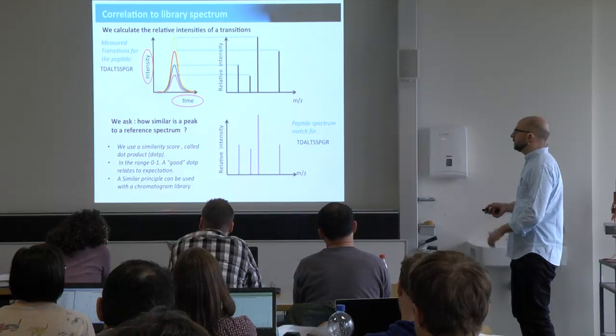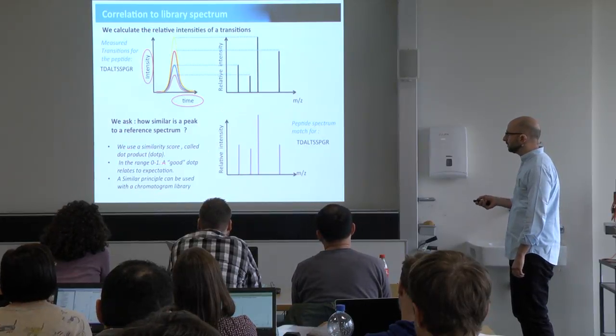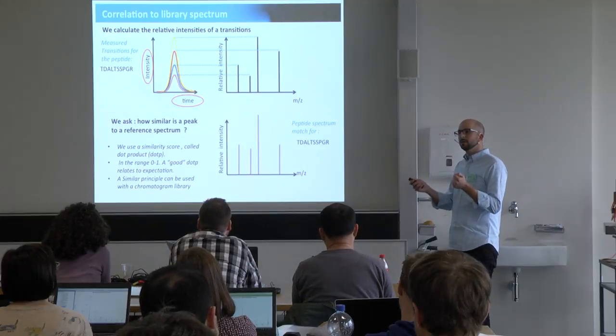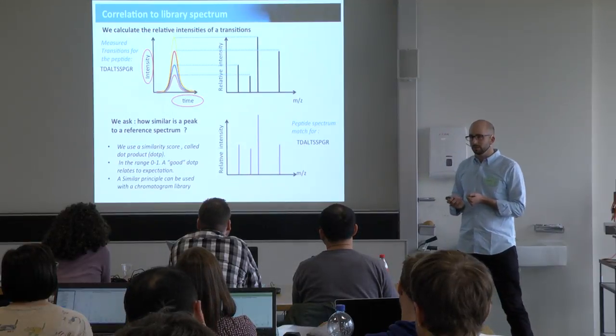Of course, we can always use the same principle of a dot product between 2 chromatograms. So we can compare 2 peaks and ask how similar are these 2 peaks in the same way.